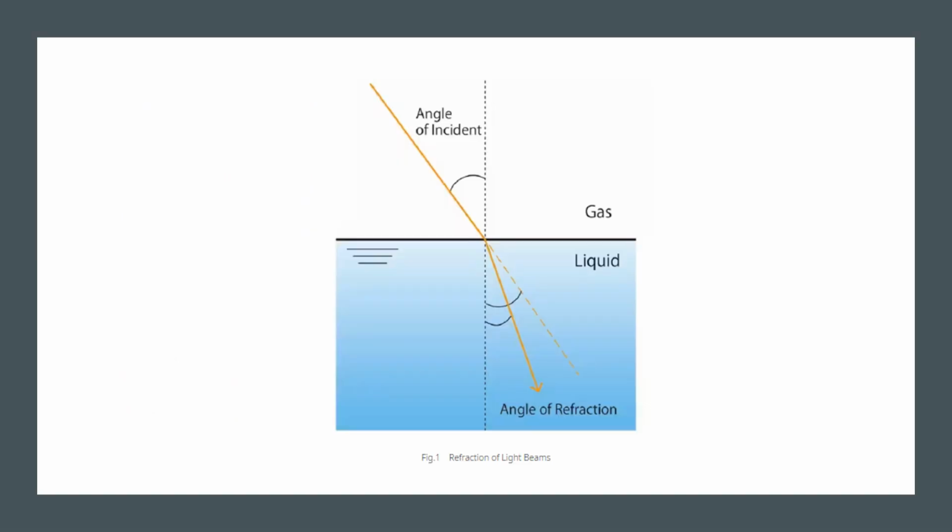Now coming to refractive index detector. Now as I've told you all, this is a universal detector. All compounds can be detected through RI detectors. Now when a light beam or rays that transmit a substance refract at the boundaries of different substances, such as when it travels from gas through liquid, the beam of light will refract. Now this refractive index detector is a detection method that applies the principle of light refraction.